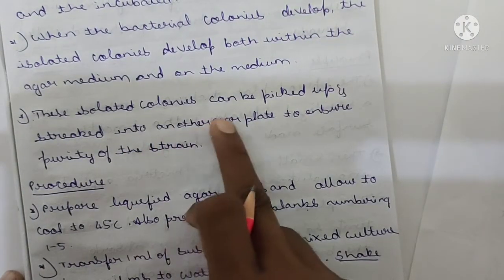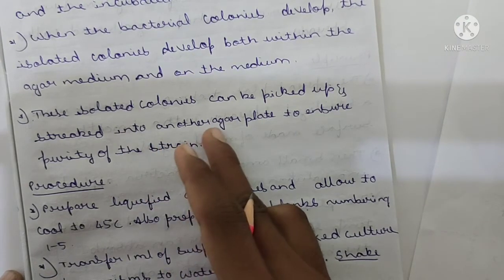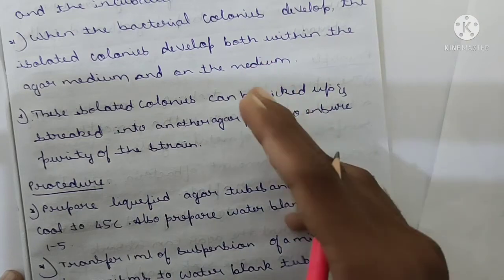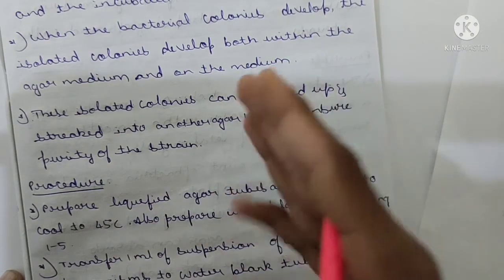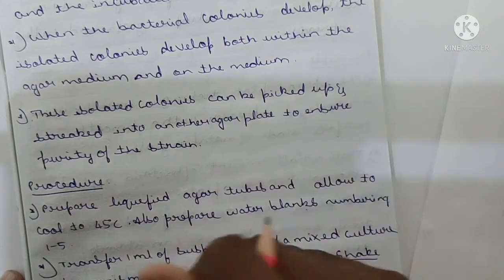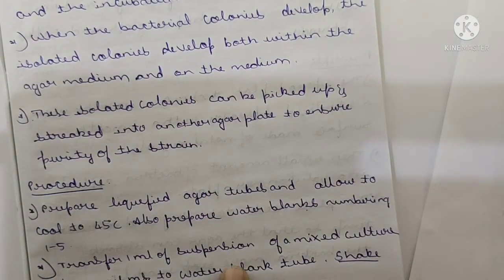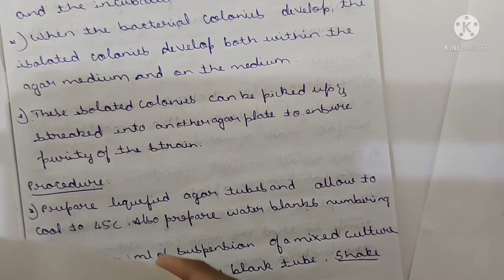These isolated colonies can be picked up and streaked onto another agar plate to ensure the purity of the strain. If we want a higher degree of purity, we pick the isolated colonies and streak them onto another agar plate.